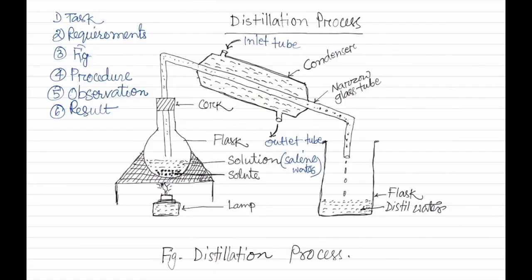There is a glass adapter on the left side of the flask to set a thermometer if it is necessary to determine the temperature. Or with the help of a spirit lamp you can produce the necessary heat. Also, to hold both the flask and the condenser in the correct position, a stand is necessary for the flask, cork or delivery tube. You can set two stands, one on the left side, another on the right side, and a clamp that grabs the tubes or flask.